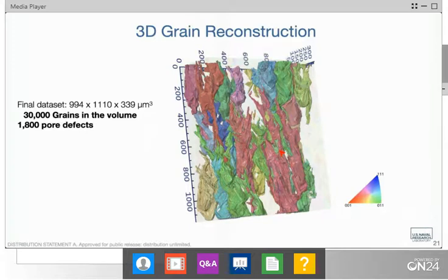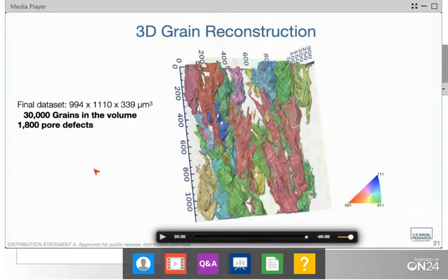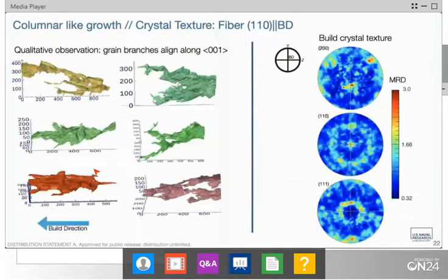When I mentioned before, the raster direction between each plane is set up with the 67-degree rotation, this kind of prime number rotation, that should be breaking up any kind of crystallographic symmetry that you might expect passing from layer to layer. Now, if we do look at some of the EBSD data, some of the traditional things you can look at, we see that if we color the grains by their IPF direction along the build direction, we see some trends.